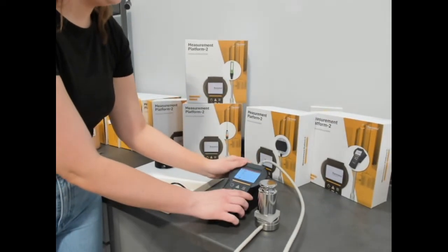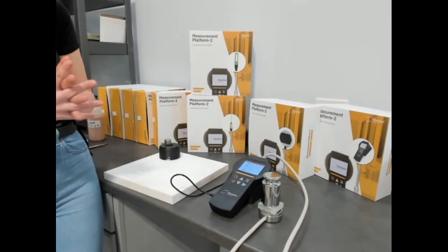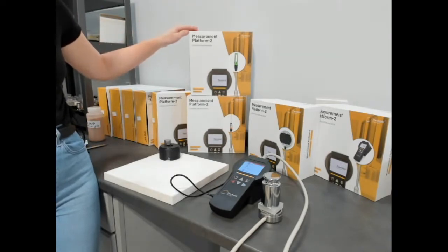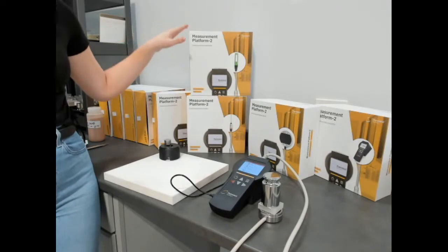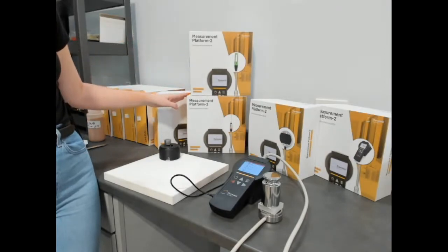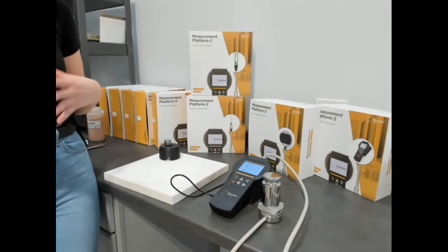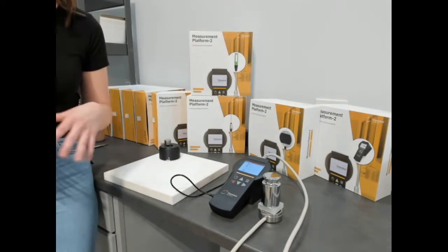In addition to the TPS4 sensor, which is designed for measuring pastes, powders, and solids, the MP2 is also compatible with the THW sensor for testing liquids in accordance with ASTM 7896, as well as the TLS series of sensors, which are designed to test soils, soft rocks, and polymers in accordance with ASTM D5334.